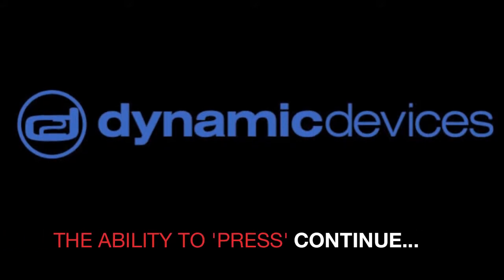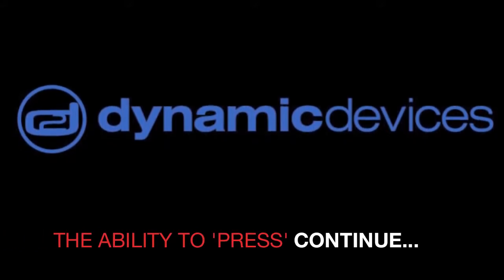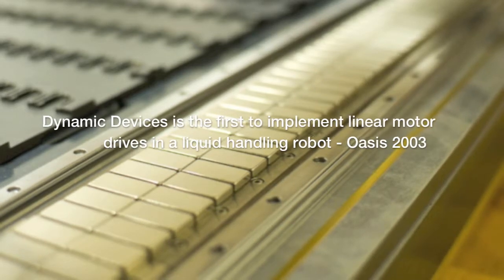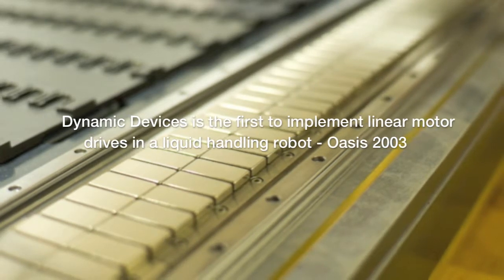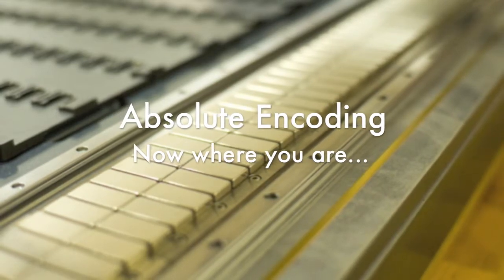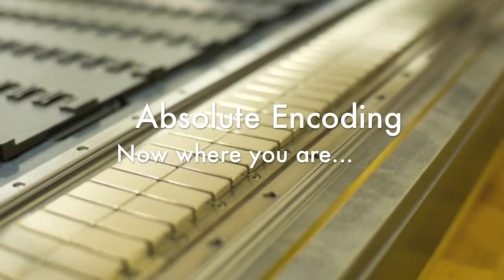No more. The ability to hit continue in a robotic system is key. With the new linear motion technology that Dynamic Devices offers in the Lynx and OASIS platforms, it is now that easy to continue even though an arm may have been completely moved out of place.